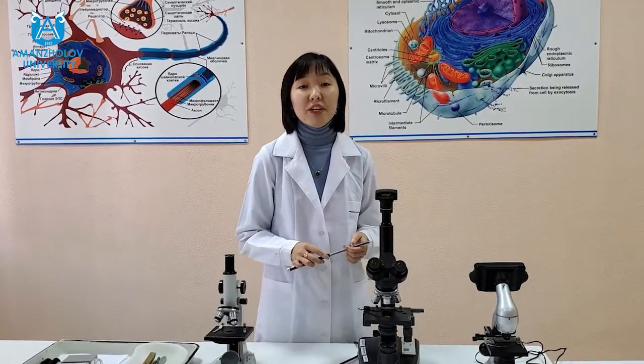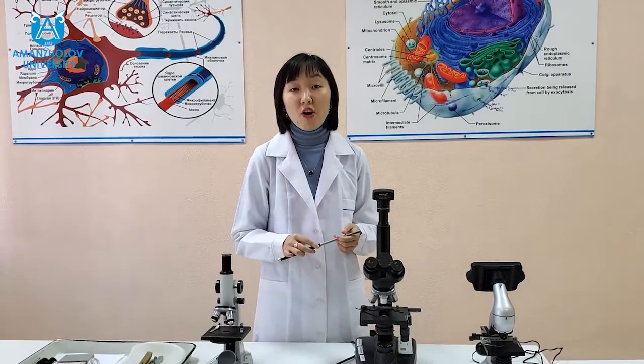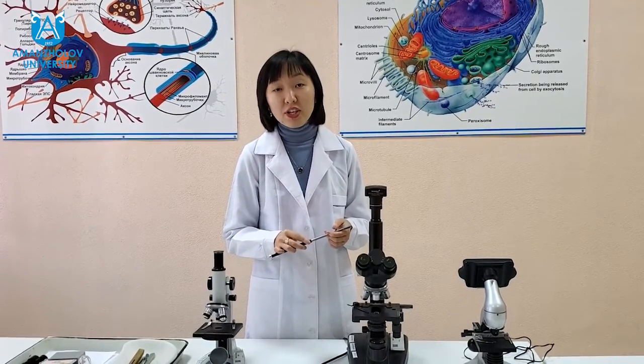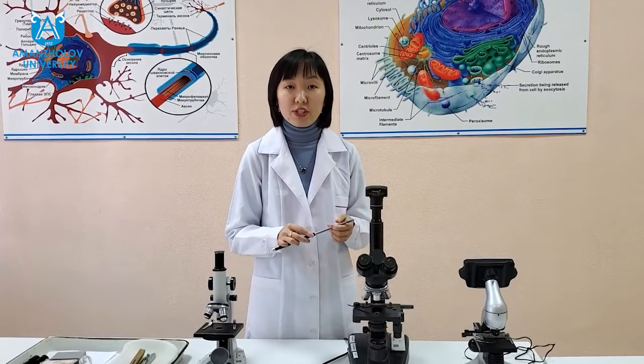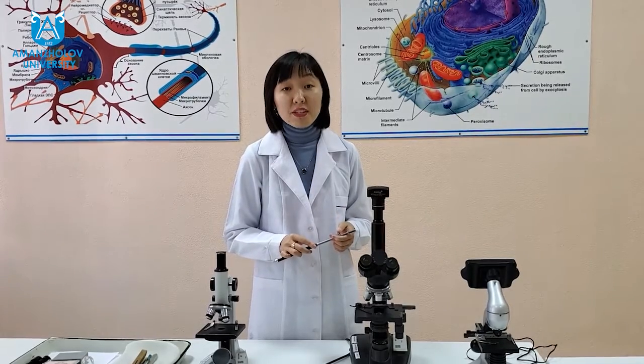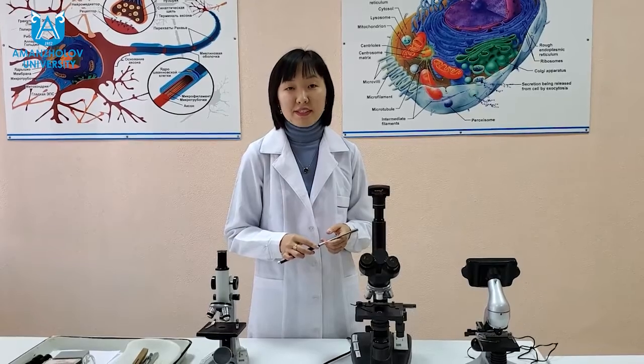Optics provides the main function of a microscope, a clear and enlarged image of an object with a sophisticated degree of reliability. In addition, the optics must provide an image that meets the objectives of the study and the requirements of analysis techniques. The main optical elements of the microscope are the elements that form the illuminating system, including the condenser, the observation system, eyepieces, and the reproducing system, including objectives.